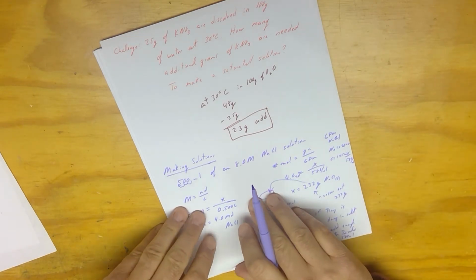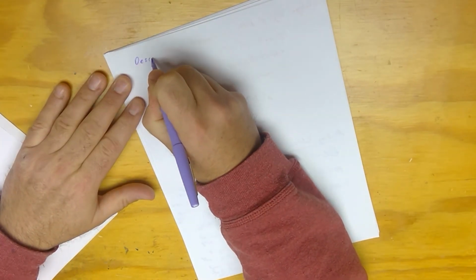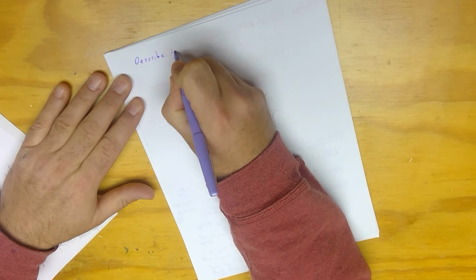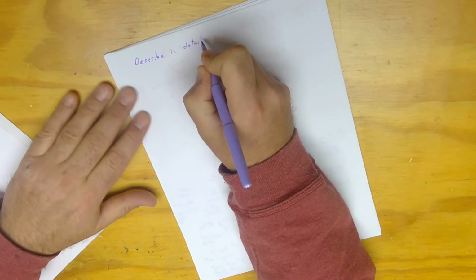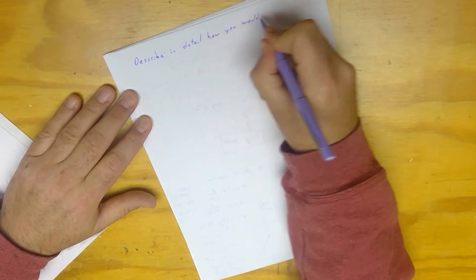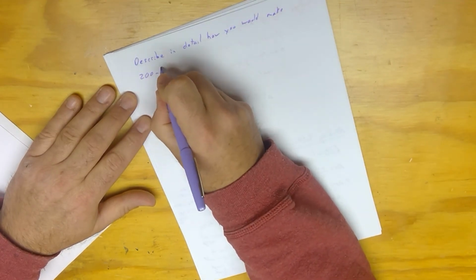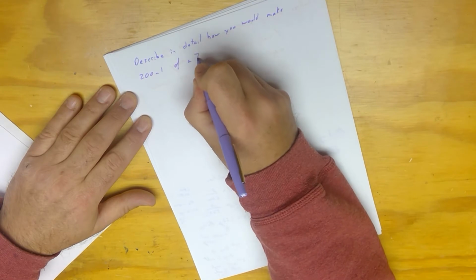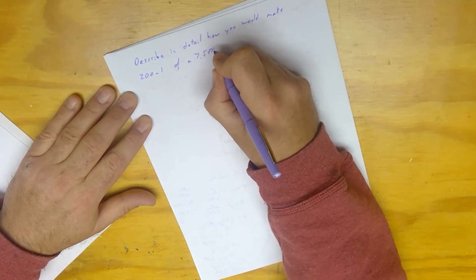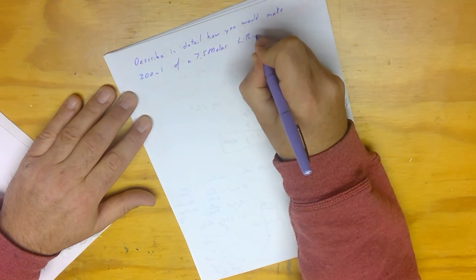All right, let's practice with another one. I actually want you to do one. So here's the problem. We're going to describe in detail how you would make 200 milliliters of a 7.5 molar lithium carbonate solution.